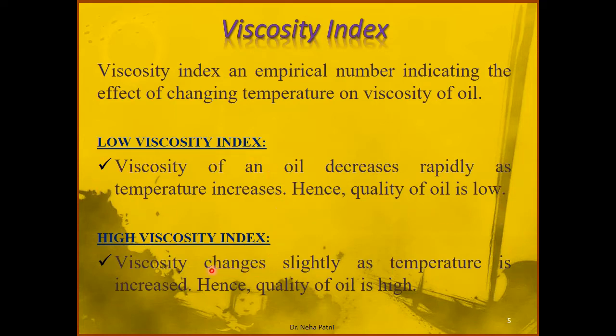At the same time, if the viscosity is not changing much with respect to temperature, meaning there is very slight change in the viscosity, you may say the lubricant is of good quality, because the viscosity is not changing and the lubricant can serve its purpose. So the quality of oil is high, and we'll call it a high viscosity index oil.